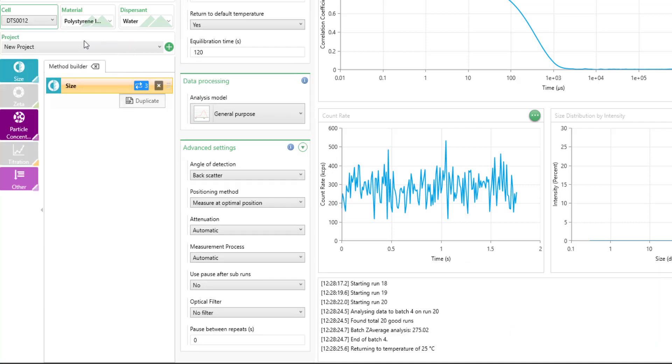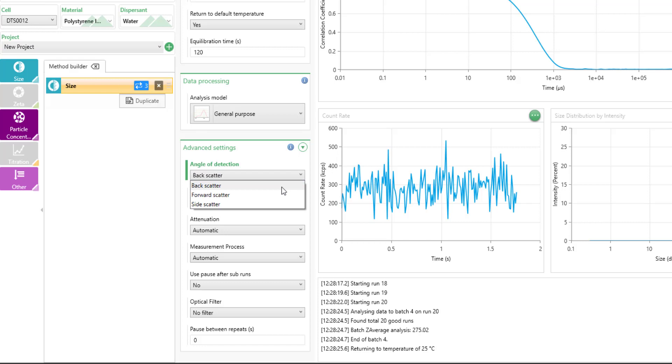If I have another cell selected, such as the regular disposable cell, I have many options on a Zetasizer Ultra to change to the three different measurement positions. If you have the pro, you will not have the side scattering as an option.